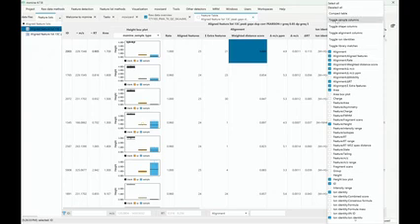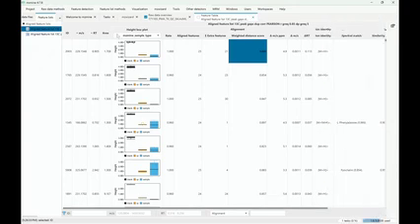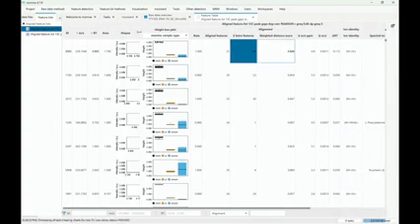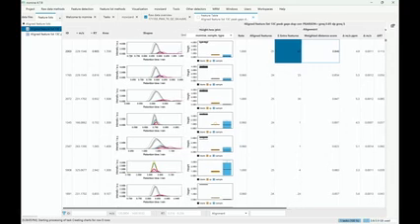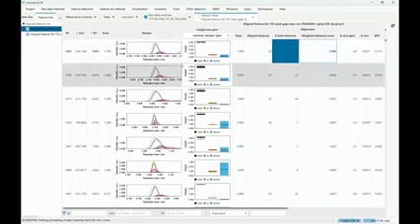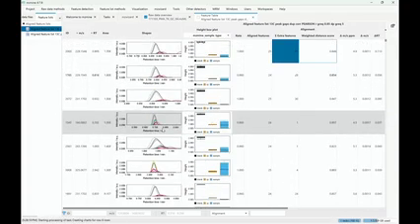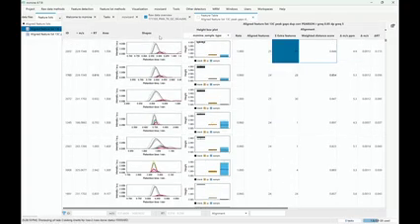So I could say, for example, toggle shape columns, and then it is gone. Toggle shape column, yeah, somehow it was off. And if I now just drag the shape column, you're going to see that there are all the different samples here. And now we actually have the chromatograms, and they're actually not chromatograms, they are separated features with retention time, with MZ, with all these things. And you can see that the color here, for example, matches up.